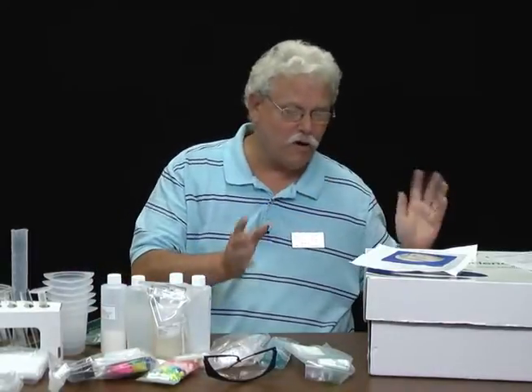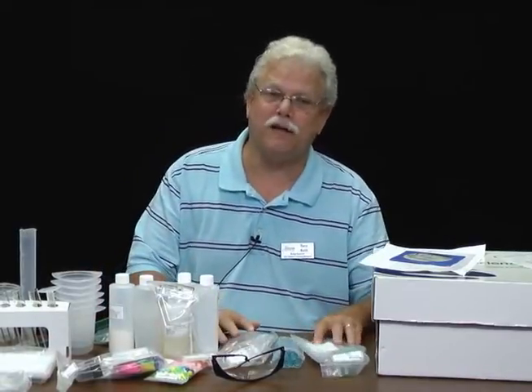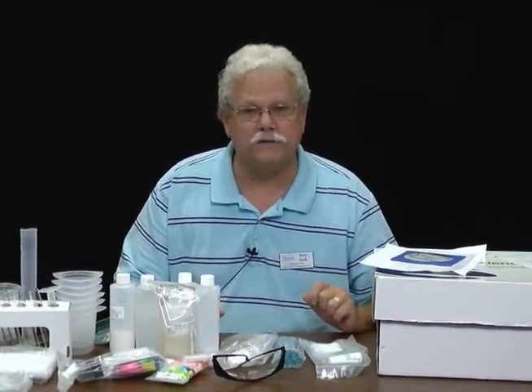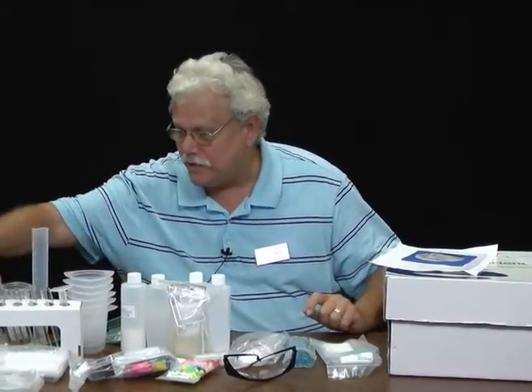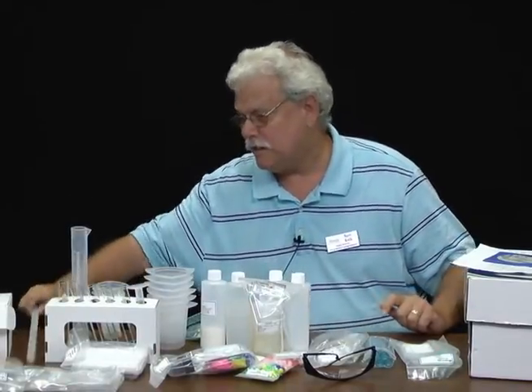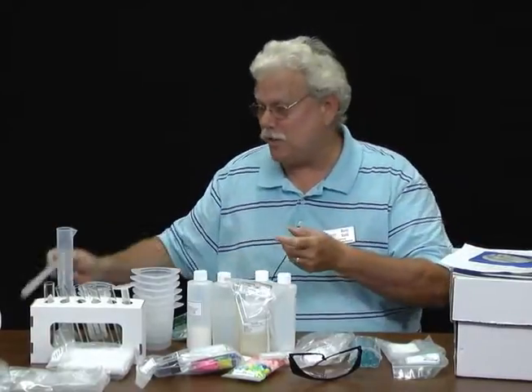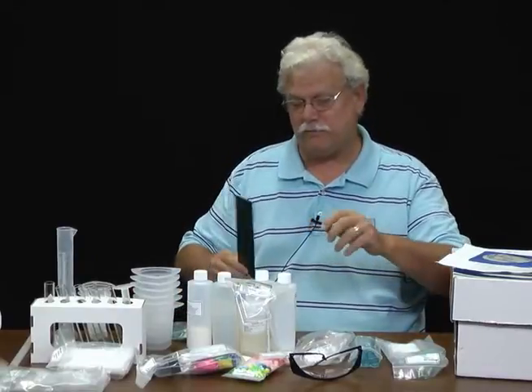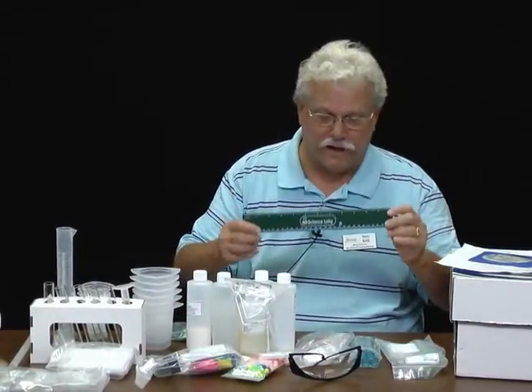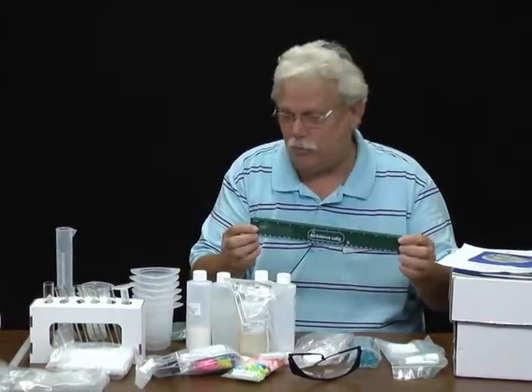There are no skeletons. There are no preserved animals in this particular kit, but if you take anatomy and physiology, you probably will have a skeleton, and you probably will have a preserved animal for dissection, but not in Bio 110. We don't do that. Here's a test tube rack and test tubes, graduated cylinders, beakers. You have a thermometer that you can use, glass, so be careful. All of these items are in metric, so you'll learn how to use the metric system. Here's a nice metric ruler that is supplied for you. So some of these items you can keep for years to come.